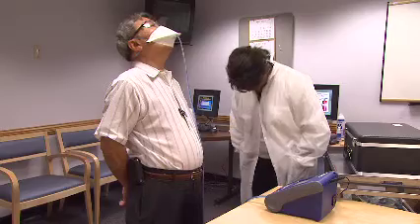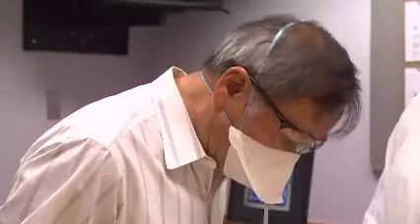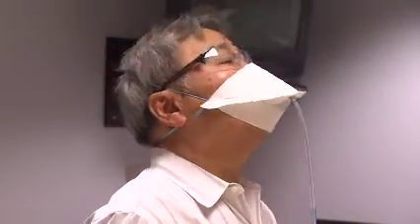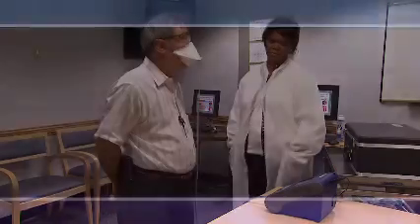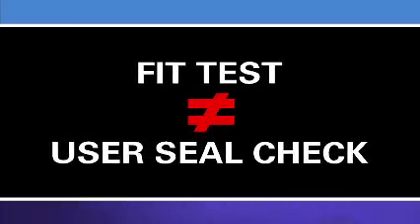A fit test tests the seal between the respirator's facepiece and your face. It takes about 15 to 20 minutes to complete and is performed at least annually. After passing a fit test with a respirator, you must use the exact same make, model, style, and size respirator on the job.